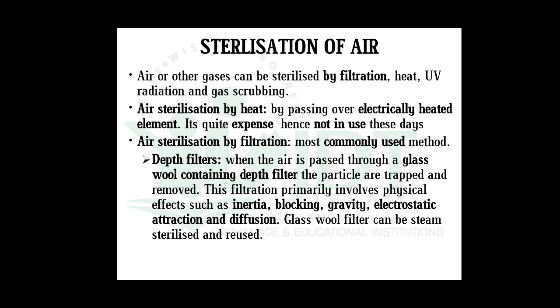In order to do that, we have to sterilize the air. The air or other gases can be sterilized by the filtration method, or by heat or UV radiation, or by the gas scrubbing method. The air sterilization by heat is by passing over electrically heated elements.